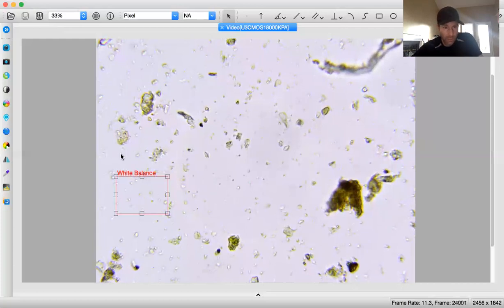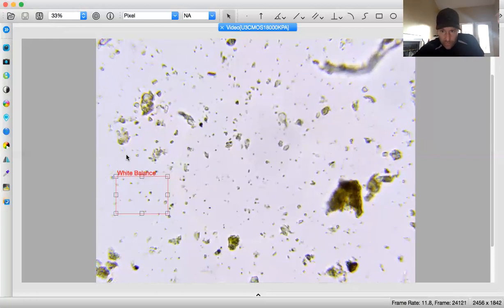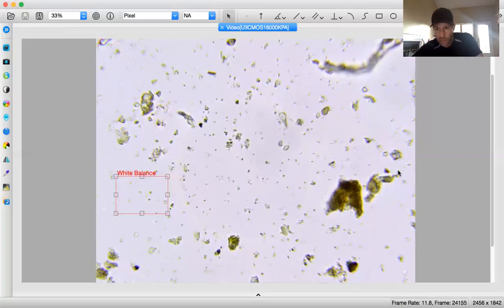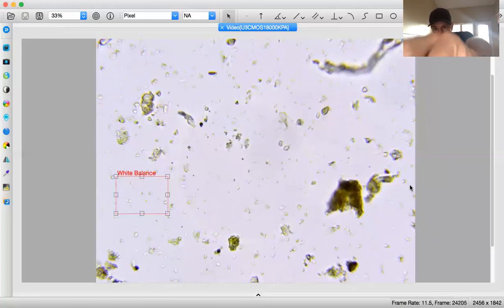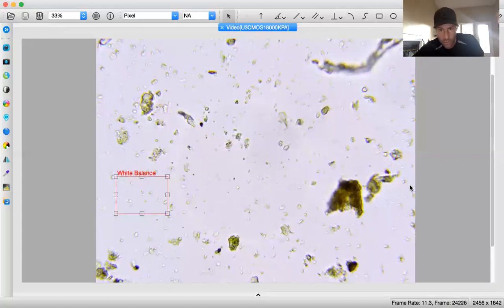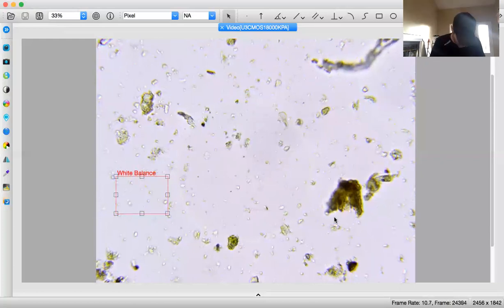I believe this could be a little actino. It's filamentous. I'm counting it as a 0.05. And I believe this might be the counterpart to that. So that looks like another 0.05. So we're going to call that a 0.1 total for actino on this frame. Now that does have a bend in it, but it's not a bend like a lactobacillus. So I'm pretty secure in calling that an actino filament. So we're going to call that just a 0.1.